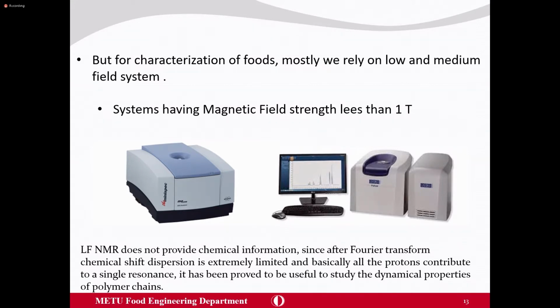And in order to do that, as I told you, the sample volume usually should not be that high, because to obtain a nice spectrum for good chemical information, the sample volume should be small, and the homogeneous magnetic field in the NMR system corresponds to that small volume. If your sample is big, then it might not fit the homogeneous magnetic field in your system, and that could introduce bias to your data.